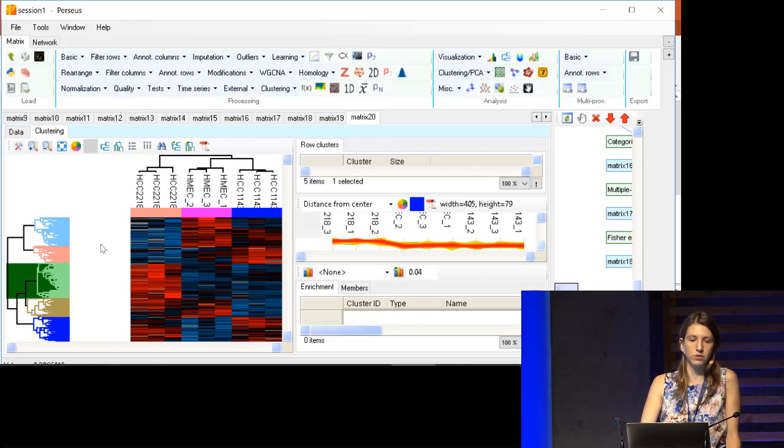Because maybe you say in this case it's cell lines, but if it was more really looking at different subtypes of a disease or disease versus health, you would really know that you want to contrast these groups. So then you would search for clear clusters that are very distinct between these two groups. No, I meant in the protein, the same. Yeah, in this case, there's no optimal number, yeah.